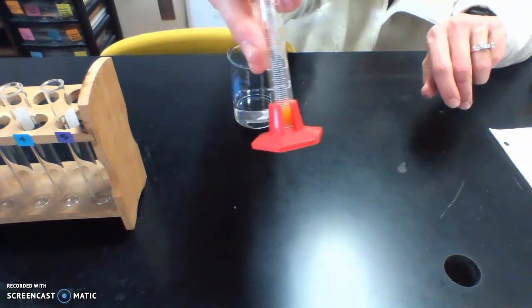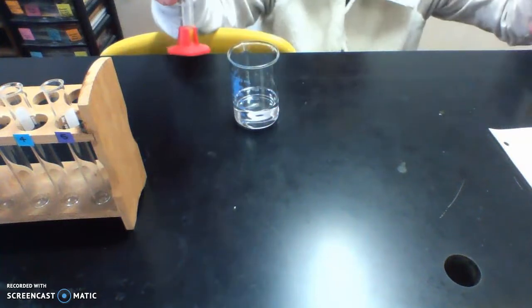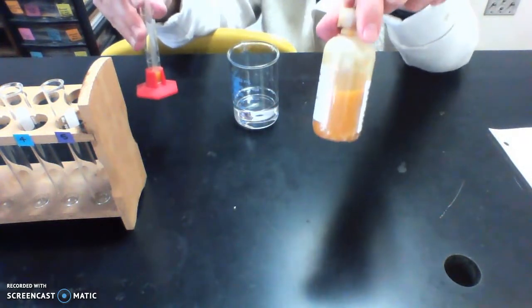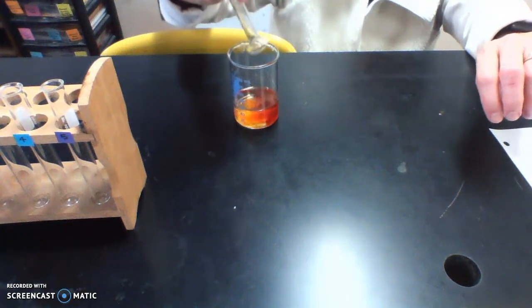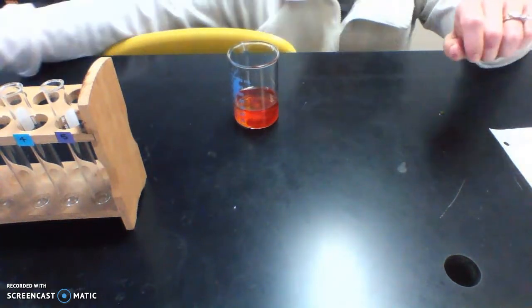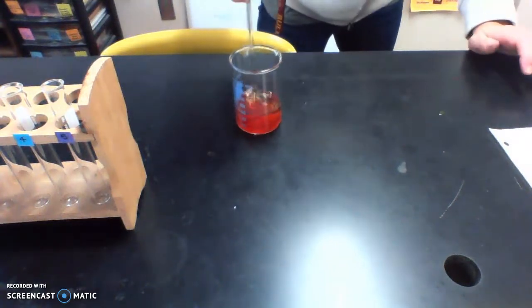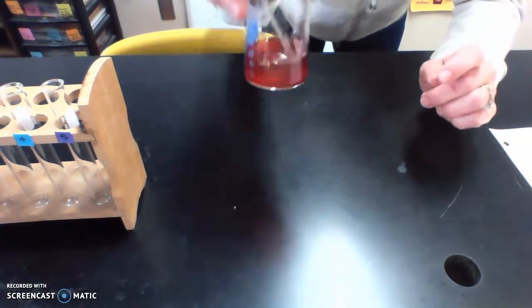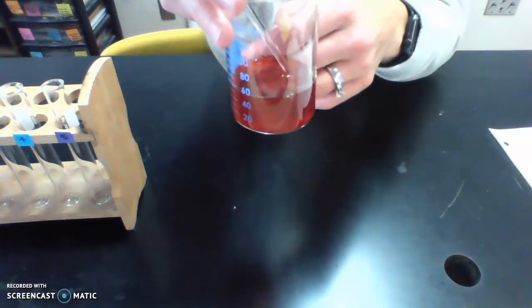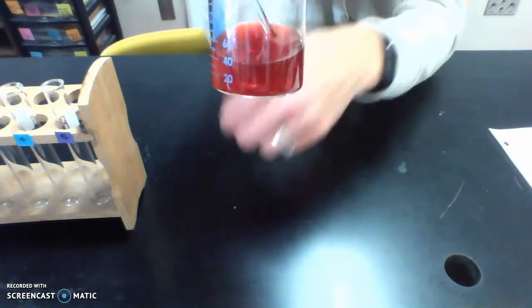And it's kind of this orangey color, right? You can kind of see it in its original bottle here. All right, so I'm going to dump this in here. And it goes from this orangey color, you can see it changing. I'm going to give it a stir to this red solution. And it is see-through. You can see through it. Maybe it's hard to tell on the camera, but maybe you can see that.